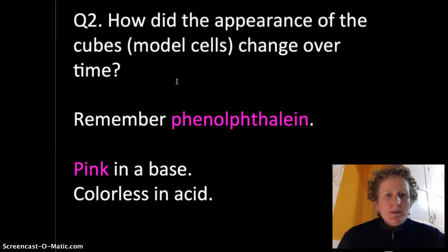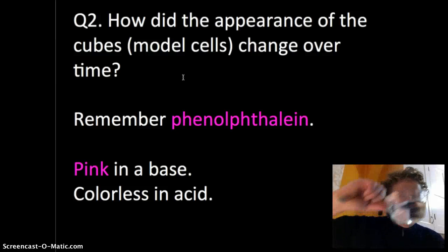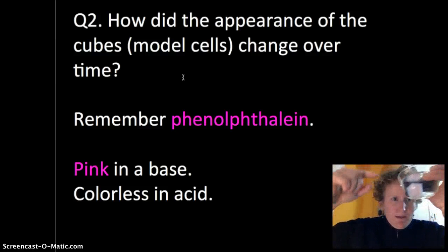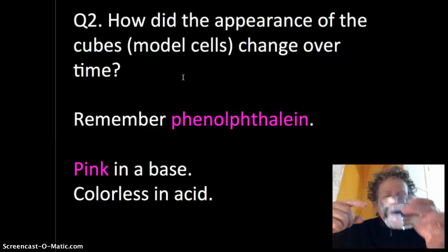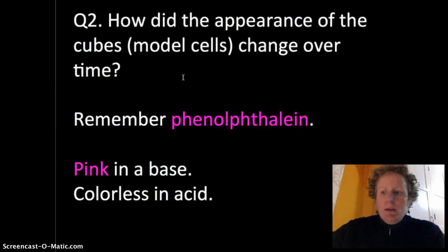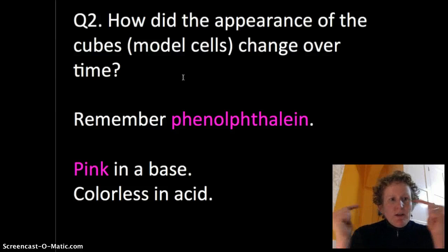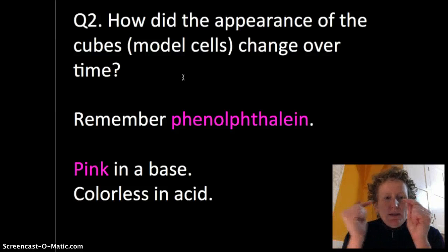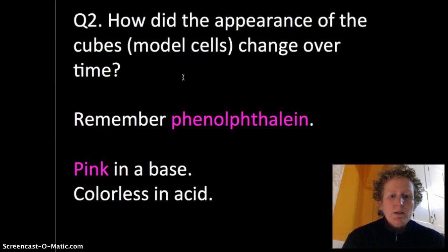The appearance of the cubes, the model cells, are going to change over time. Remember phenolphthalein from an earlier lab? That's the pink stuff inside these cubes. It's pink in base and colorless in acid and you're going to see that the outside of the cubes are getting very white because the vinegar, the acid, starts to diffuse into the agar cubes and they're going to turn colorless.